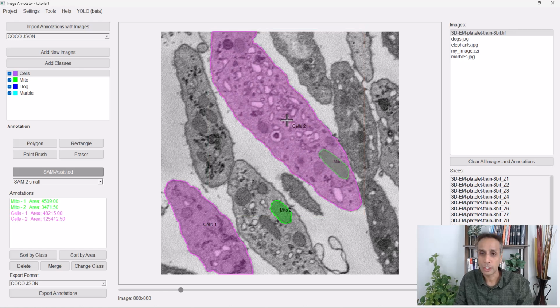Okay, I guess I cannot show you a situation where it fails. It's doing an amazing job even on cells like that. I'll do one more. Let's pretend this one is not good. Okay, this one is also good, but let's say this is not good. I don't like it because the probability is not good. So I'm going to hit escape. It's gone. And I'll click and drag again. Slightly different region. Okay, so I'm going to accept it.